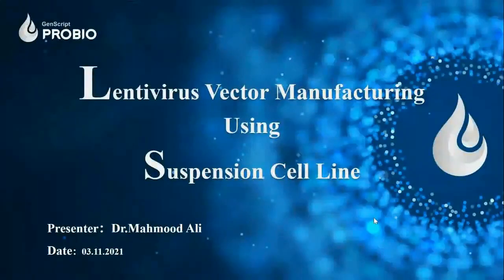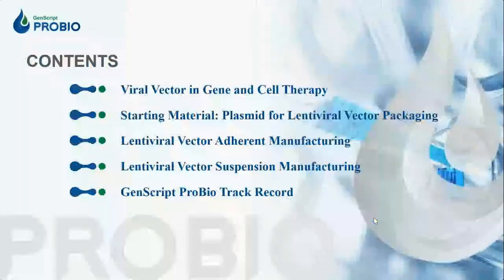So, lentivirus vector manufacturing using suspension cell line. All right, so here is the content for today: the viral vector in gene and cell therapy; the starting materials, like plasmid, used for lentiviral vector packaging; the lentiviral vector with the adherent manufacturing, and then the suspension manufacturing. And last but not the least, I would like to talk about the GenScript ProBio track record.